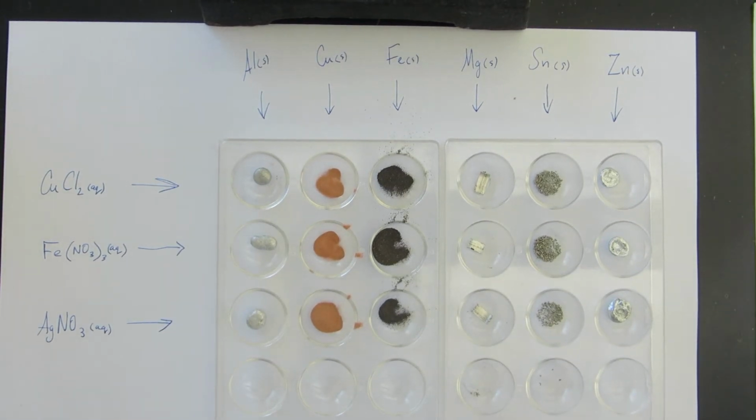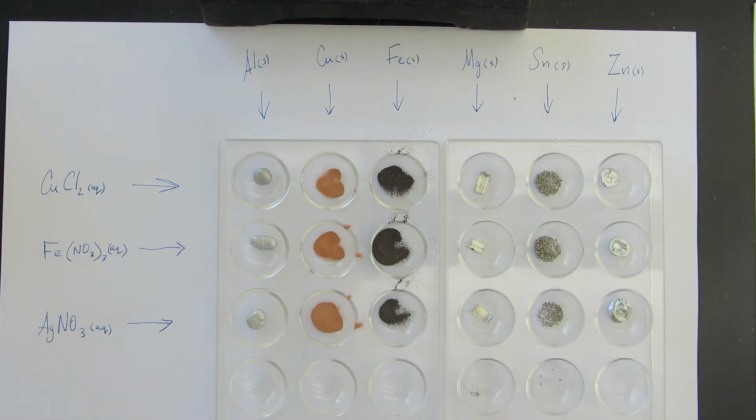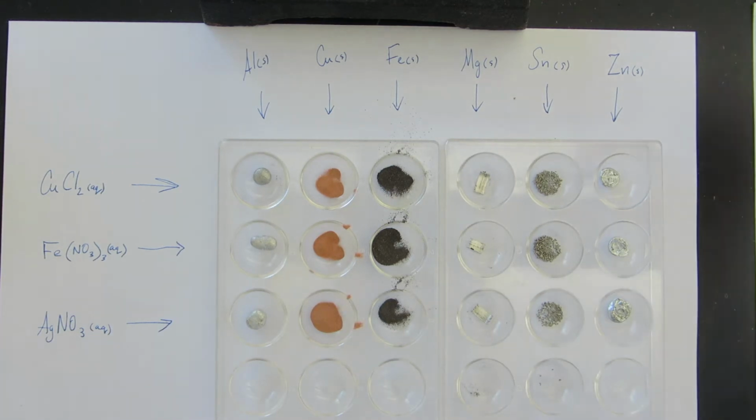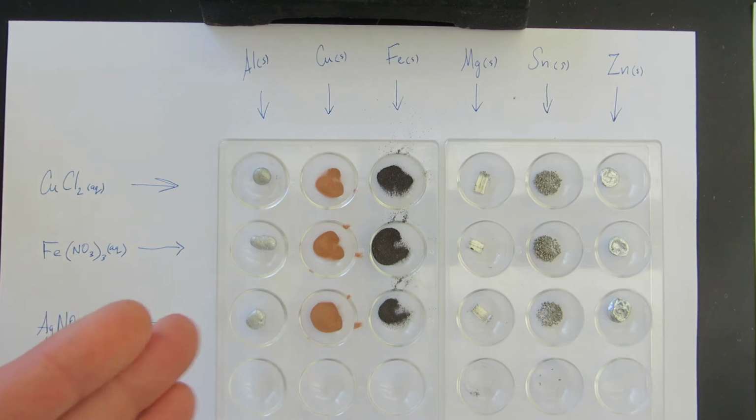Here we're looking at some elements. Written across the top you see aluminum, copper, iron, magnesium, tin, and zinc. You can see SN, tin. Across the left we have copper chloride, iron nitrate, and silver nitrate. And these are going to be added to the elements.